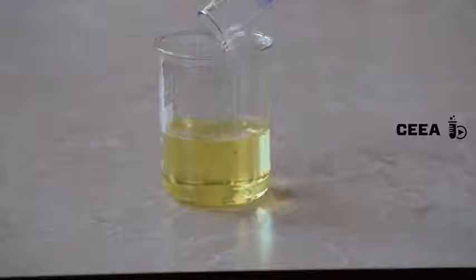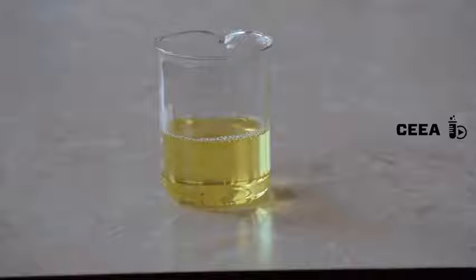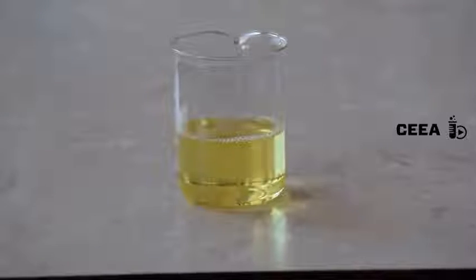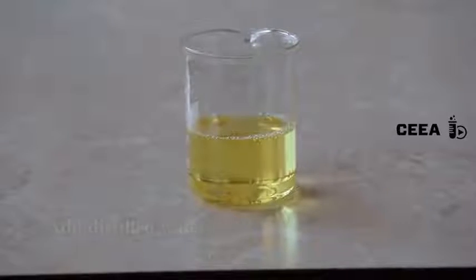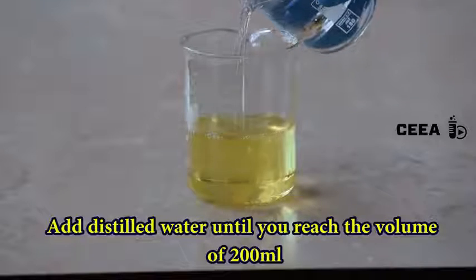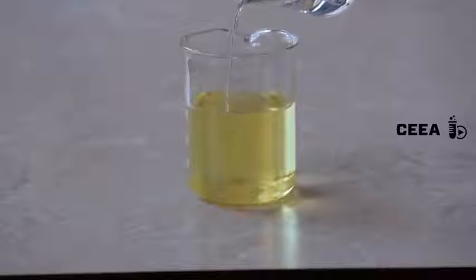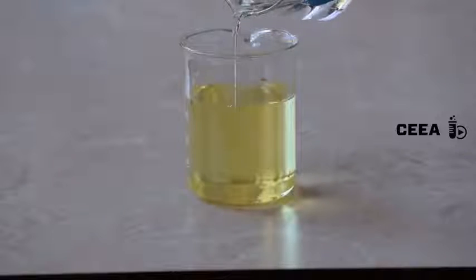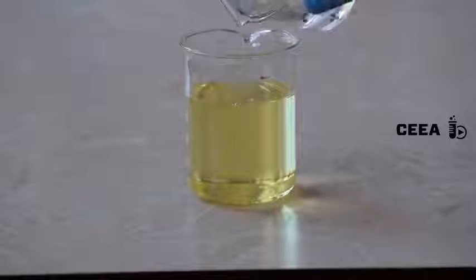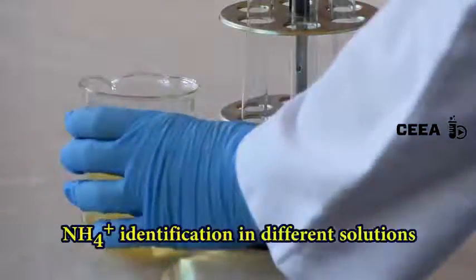We notice a color enhancement of the mixture. The Nessler's reagent is complete when we dilute the mixture to a volume of 200 milliliters by adding distilled water. Now we use this solution to mark the presence of ammonium ions in different solutions.